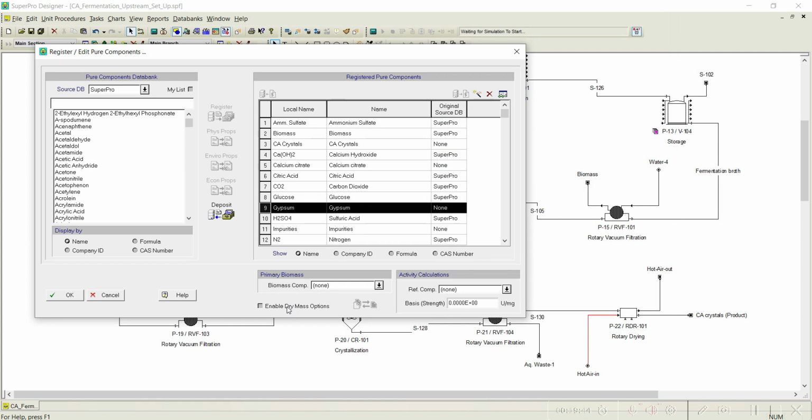Click OK. Please do not forget to make these changes, because when you set up a stoichiometric equation you are going to face this problem. That is the reason it is important to change the molecular weight. The rest of the properties we go with the default ones. If any changes are required later, for example when you do economic calculation, we need to set up the prices, and also labor. All these things we will look into later. As of now, for this particular tutorial and this isolation step, I have just changed the molecular weight.